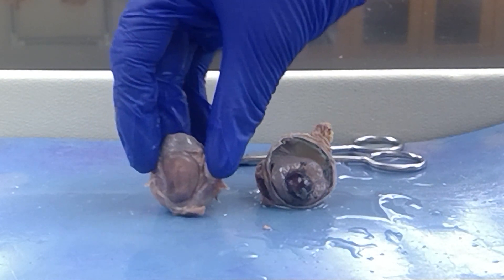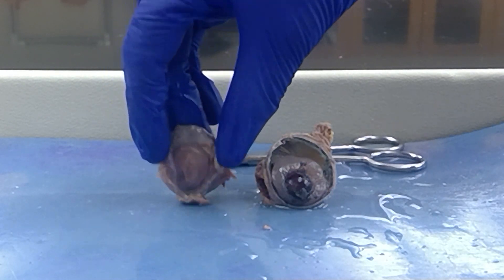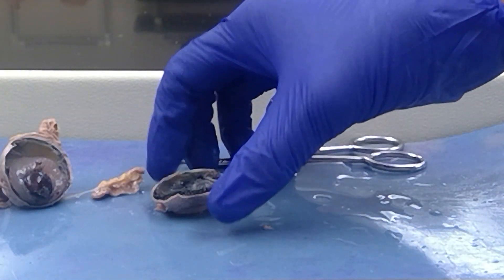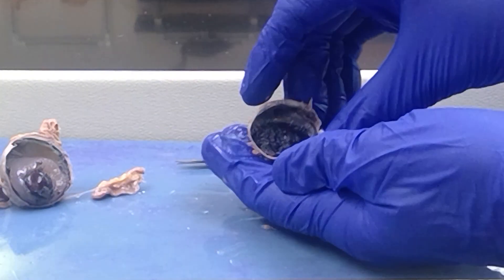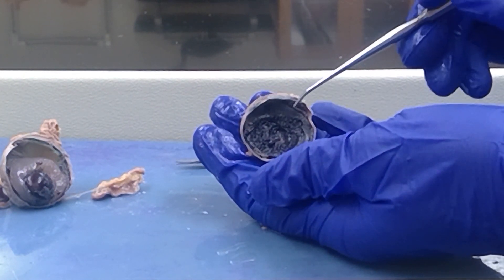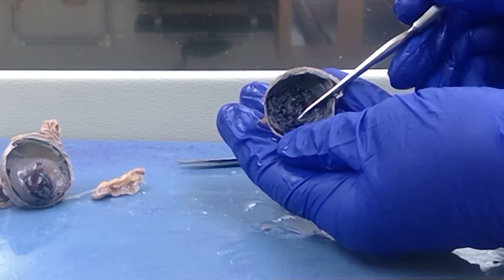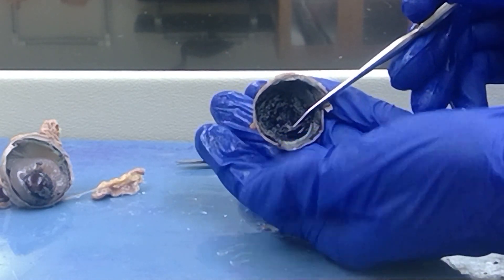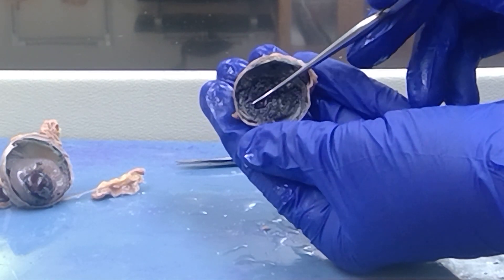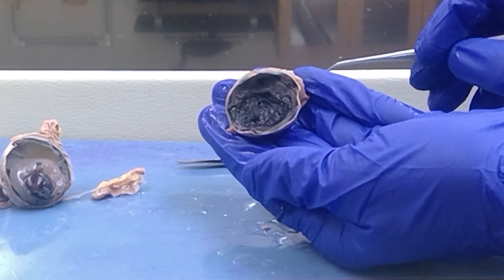Let's cover the anterior portion first. I'm going to tip this over so you can see into the anterior portion of the sheep eye. The first thing I want you to notice is this black mushroom looking cap — and that black mushroom looking cap, which I will show again on an eye model, is the ciliary body.